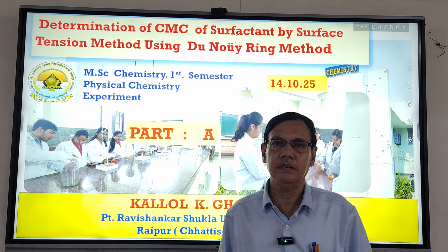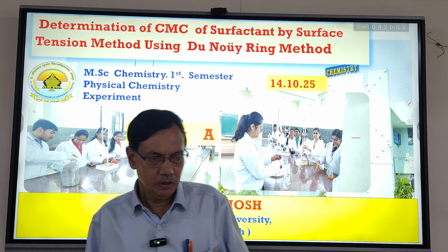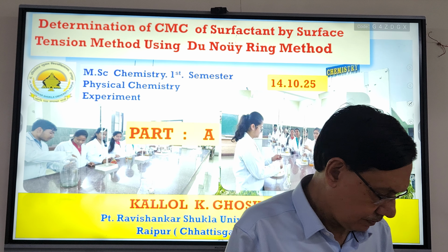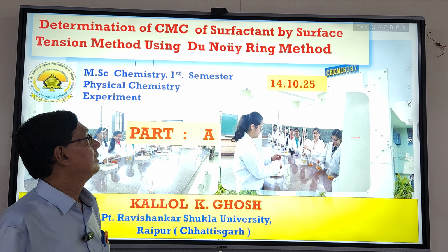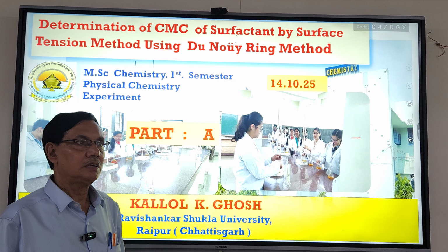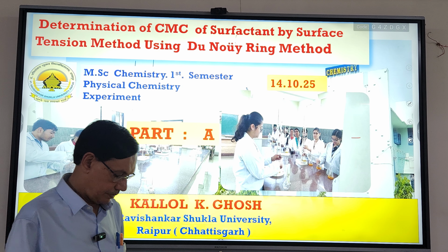As you know, you have to perform a large number of experiments during your course, and one of the most important experiments is determination of critical micelle concentration of a surfactant by surface tension measurement.